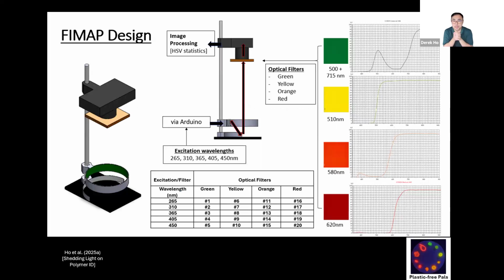This is now the fun part. Now that we've gotten the fluorescent stained plastics, we can then subject them to excitation and detection with our camera.